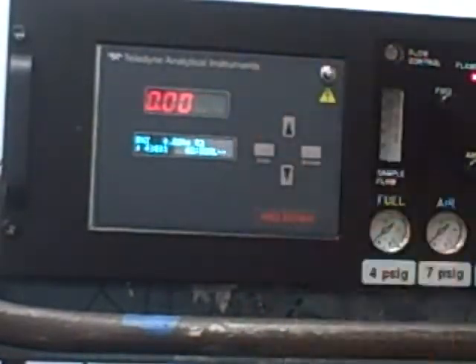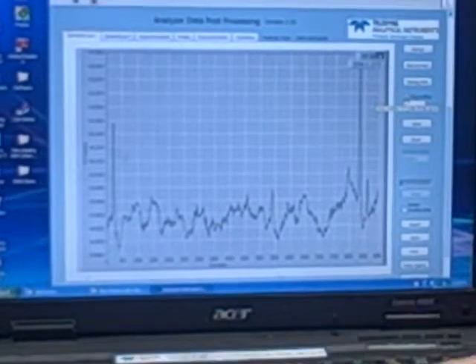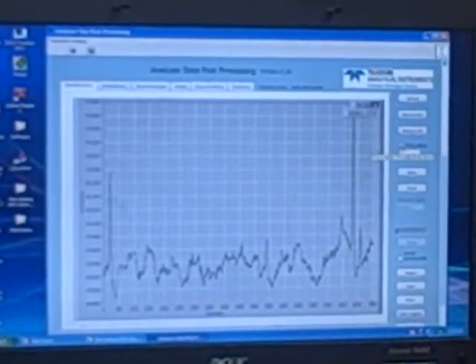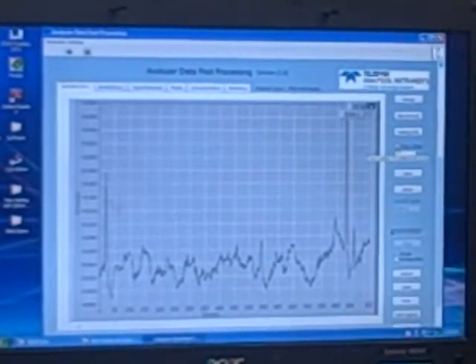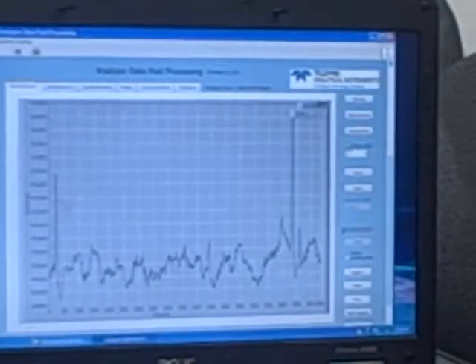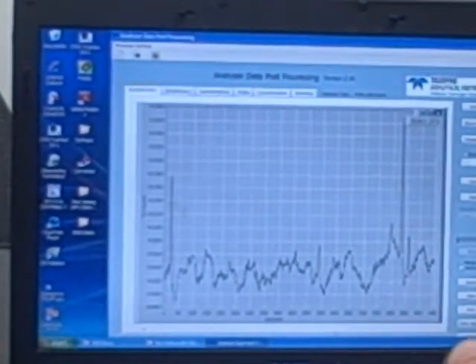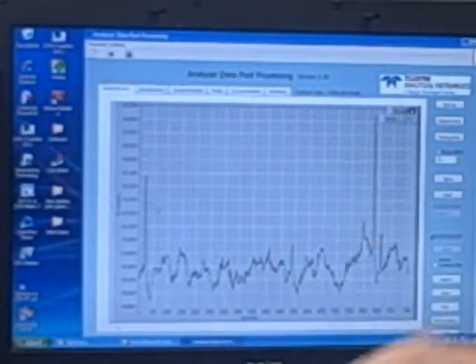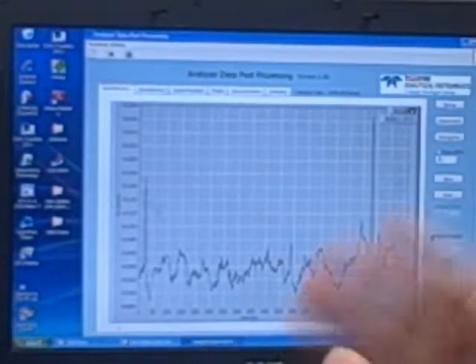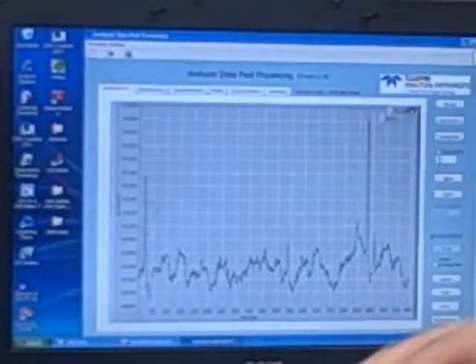Okay. And then, after you are done with the test info, you click the stop after. That will tell the computer how many cycles you want to save the data. In theory, the software or the computer is able to save 200 cycles. But you want to make the computer know how many cycles. In the meanwhile, you also can always stop anytime. If you think the cycles are enough, you can click stop. All the cycles before you click will be saved. So it's always safe to set a large number, like 200 cycles.